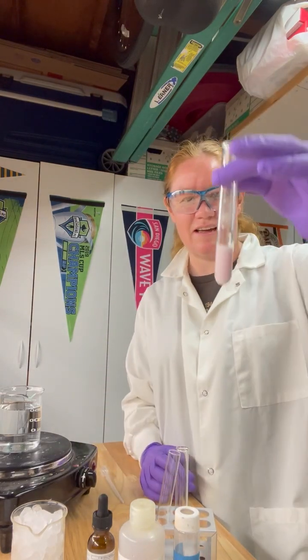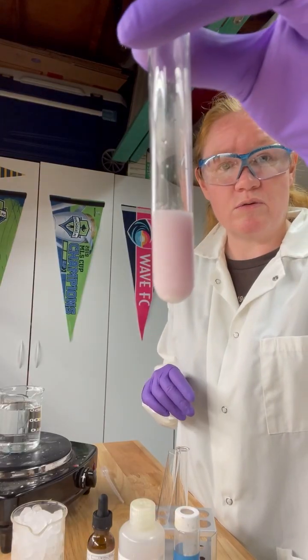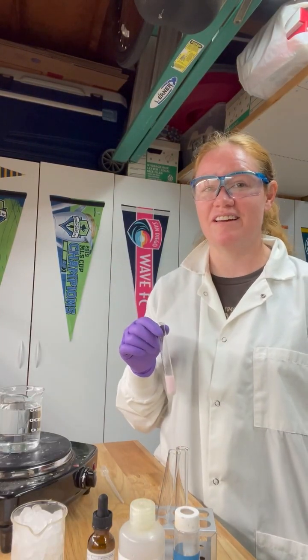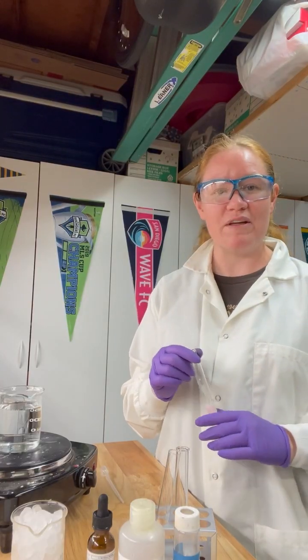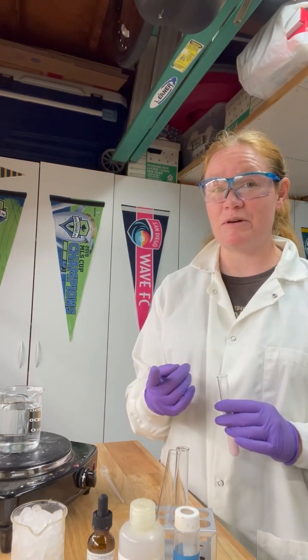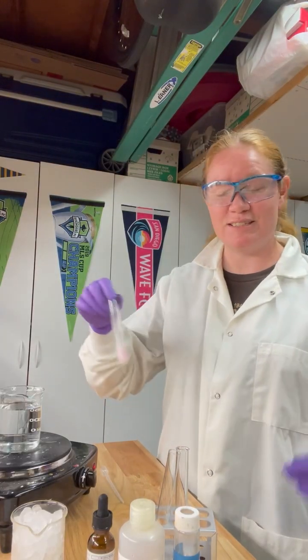Now, one interesting thing about this is you can notice that there's some condensation forming up toward the top of the test tube. This means that somewhere along the way, there was some heat involved in our reaction. So we're going to dunk this in a hot water bath and see what happens to our system. Is it going to stay pink or is it going to turn blue? We're going to use that data to figure out whether this temperature change that we're seeing up toward the top here is a reactant or a product. Because remember, we can have exothermic reactions where heat is a product, or we can have endothermic reactions where heat is a reactant. So let's see what happens.